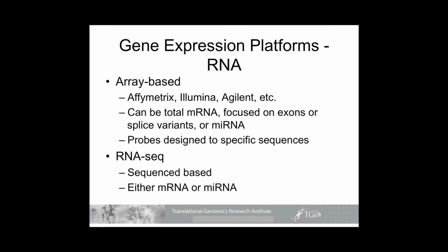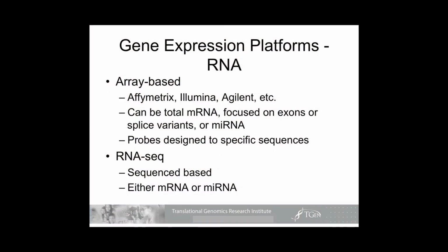The probes are designed to specific sequences, and this is really important to keep in mind. You are not measuring everything. You are only measuring what's on the array. And that's important when you go to interpret the data. Then there is now RNA-Seq, which is sequence-based measurement of RNA. And it can be total RNA, it can be mRNA, it can be microRNA, it can be a targeted data set. It all depends on what you do to create your library.